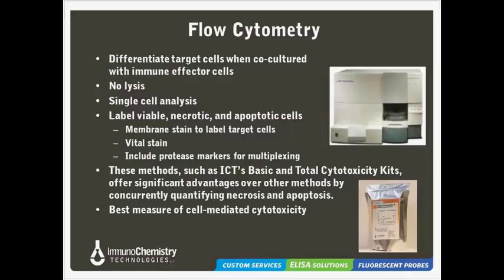Flow assays of this design have several advantages over the simpler release assays because they eliminate the use of hazardous radioactivity. There are no detrimental effects due to radiation on the effector cell population. There are shorter incubation times, and some lower cost. You can differentiate subpopulations of cells. You can analyze single cells, and you can assess the viability of the effector cell population as well as the target cell.